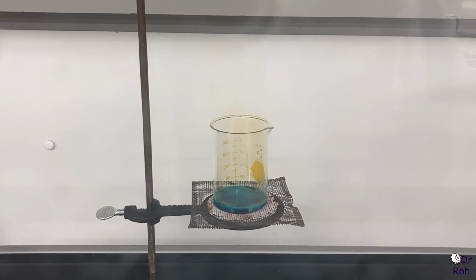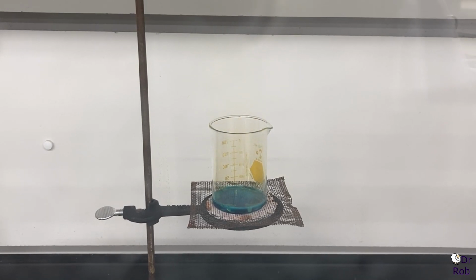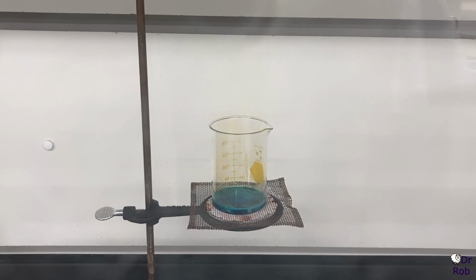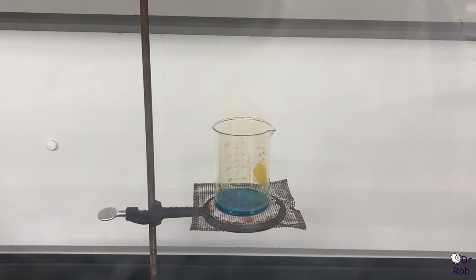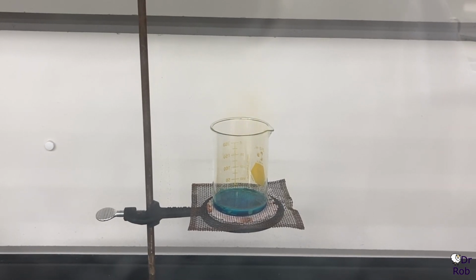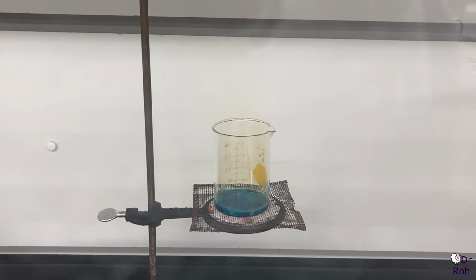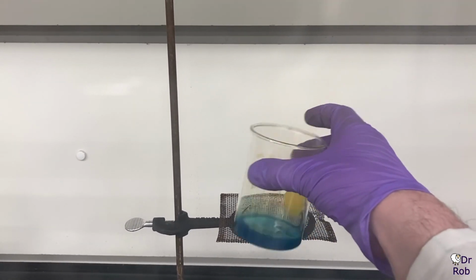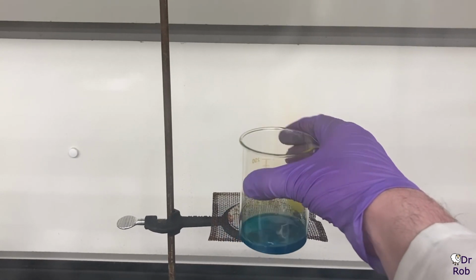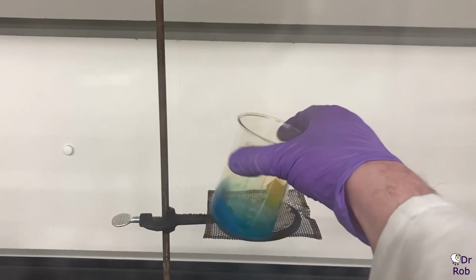So you'll see that here in a bit, although we still see a little bit of the brown gas there. If we look through the beaker to the white background, you can see a little bit of brown tint in there. Once that brown tint is gone, then you can go ahead and grab the beaker. I still definitely wouldn't take it out of the fume hood, and then you can do some swirling of it. You can see it's already a little bit more blue, although it'll get much more of a nice blue color of copper solutions later.